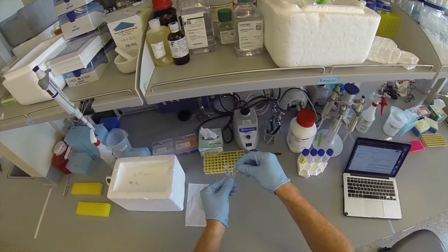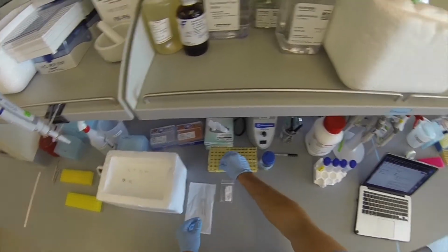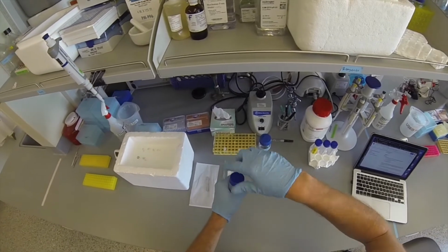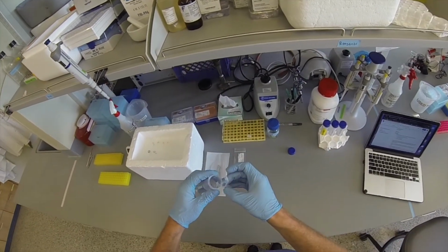To prepare the washing reagents for the tissue homogenizer, label 2 test tubes with H2O and ETOH, or ethanol, and then fill these with nuclease-free water and 70% ethanol.